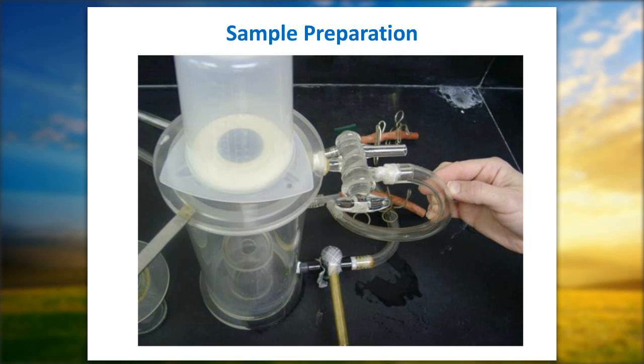Once the sample enters the Central Analytical Laboratory, we make additional observations of the sample condition. We look at contamination, and that's to ensure uniformity across the site. So maybe you missed some contamination, but what we're looking at here is our apparatus for filtering the samples. So we do make observations as we're filtering the sample to see if there's contamination that may have been missed on the observer form. And we'll be coming up to one of the preliminary data reports in a minute. You'll be seeing where we note contamination that was noted in the lab that was missed on the observer form.